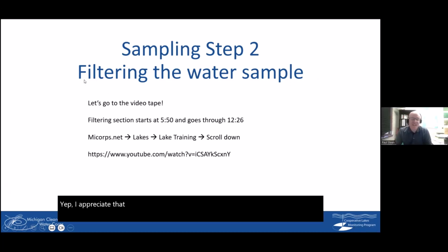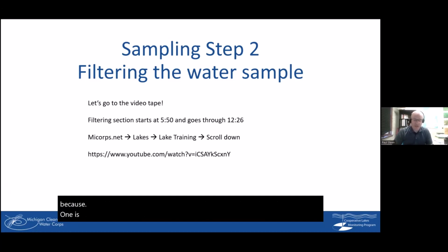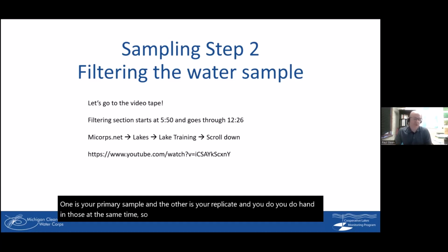All right, so you have taken your sample and it's in the freezer now, and there it sits. It was mentioned in the video, but just to reiterate, you do this whole process twice because one is your primary sample and the other is your replicate, and you do hand in those at the same time. So just to point that out.